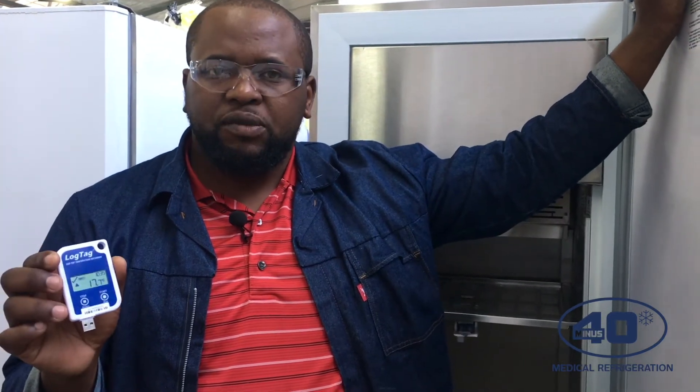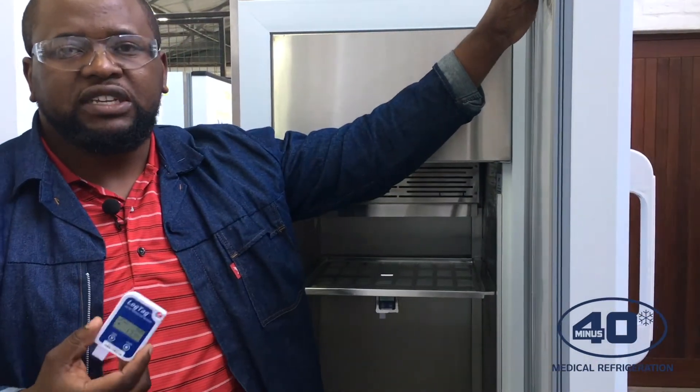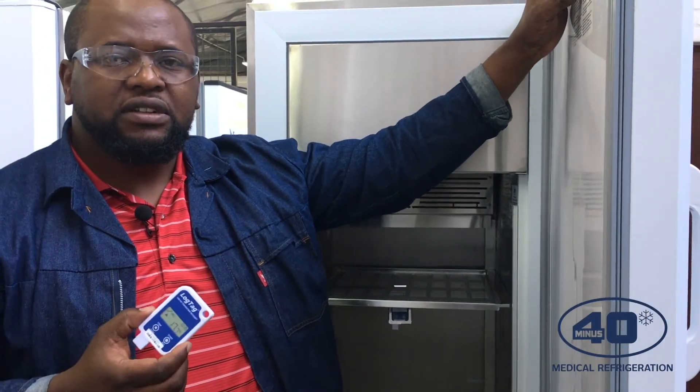Once you have your report, put the cap back on and place the LogTek back into the mounting bracket. There is also a software called LogTag Analyzer — if you want more detailed reporting, you can use that software to get a more detailed report.